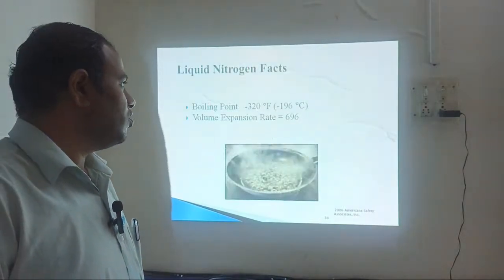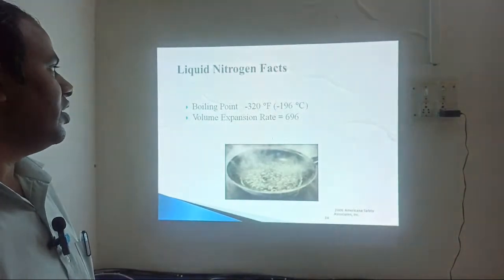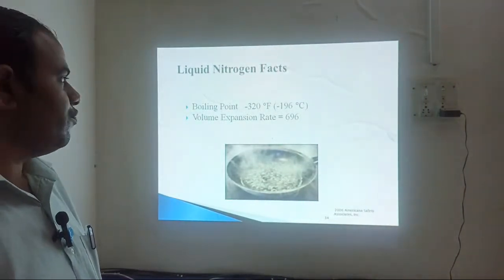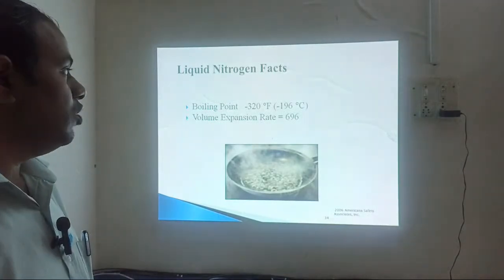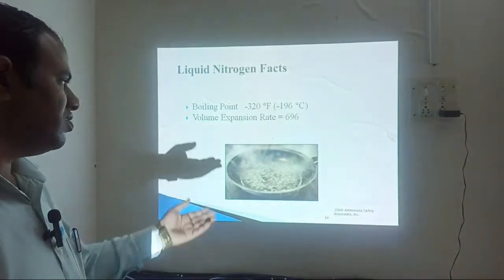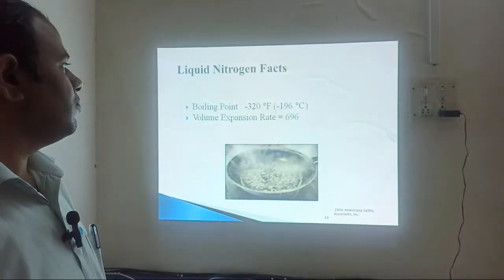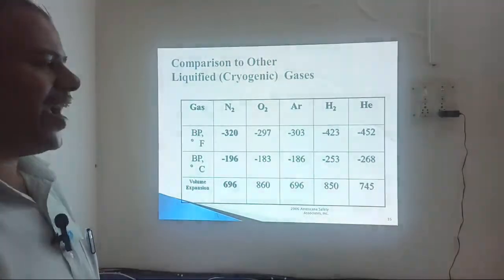Let's see some facts of liquid nitrogen. I already told you minus 196 degrees Celsius, that is minus 320 degrees Fahrenheit, is the boiling temperature. The volume expansion rate is 696 for liquid nitrogen. You can see the photo of liquid nitrogen boiling here at minus 196. So these were the different facts.